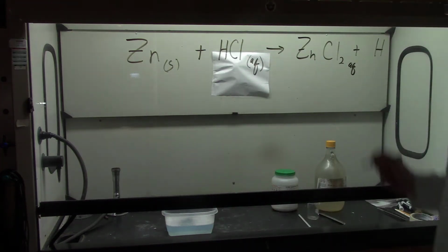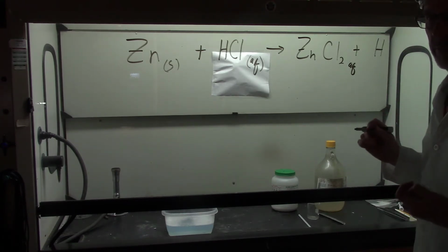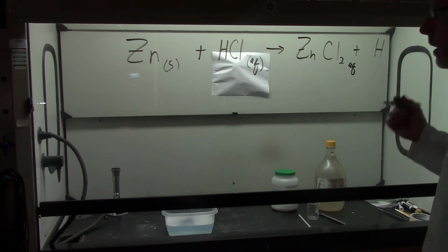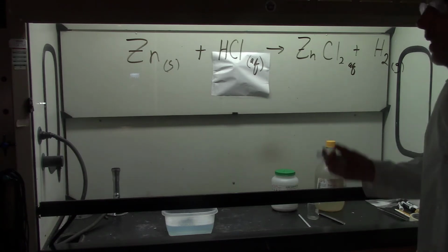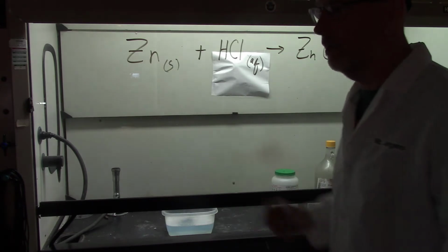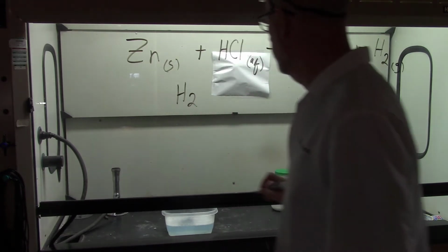And then the other problem that we have right now is that hydrogen is here by itself, and that's one of the lucky 7. Hydrogen, nitrogen, oxygen, chlorine, fluorine, bromine. Those are, if they're by themselves, they form buddy partners. And so that would actually be a gas. That's the stuff that's bubbling out. There's our first reaction. What kind of reaction is this? This is a single replacement reaction because zinc and hydrogen are fighting for chloride. So the bubbles are made out of hydrogen gas, H2.